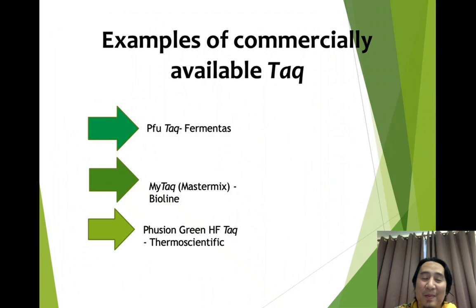This is an example of commercially available Taq. You can use Pfu Taq by Fermentas, which is the company name, MyTaq Mastermix by Bioline, or Phusion Green HF Taq by Thermo Scientific.